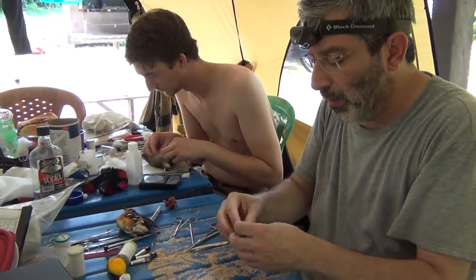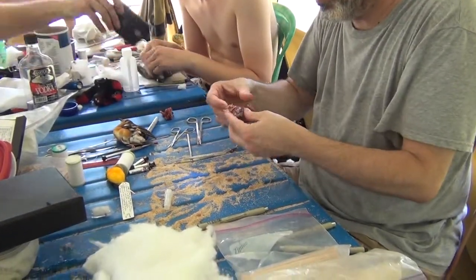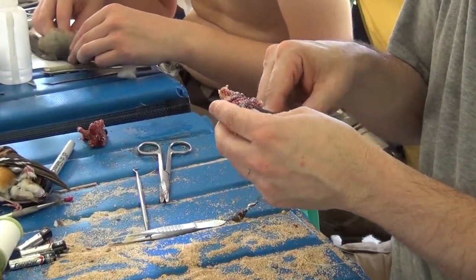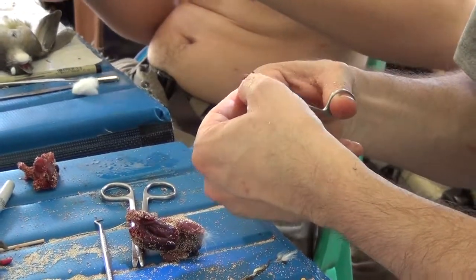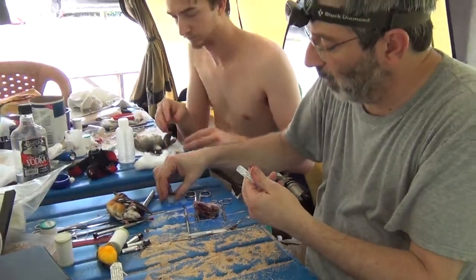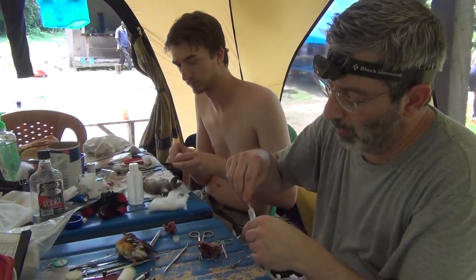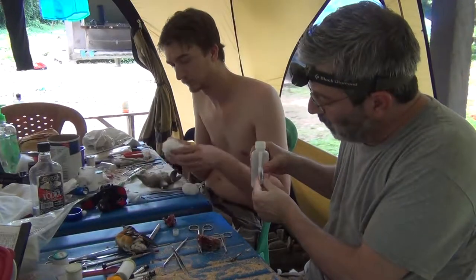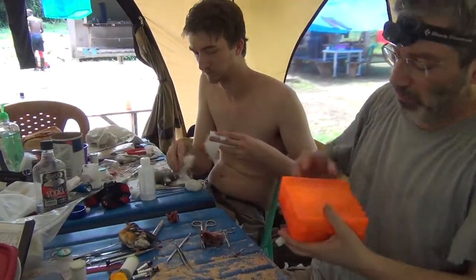I'm going to set the skin aside and get right on the bird body because we're very interested in what the sex of this individual is. This tissue is going into ethanol to be able to work with and sequence the bird's DNA later. Here's the ethanol, and that tube goes in its box.